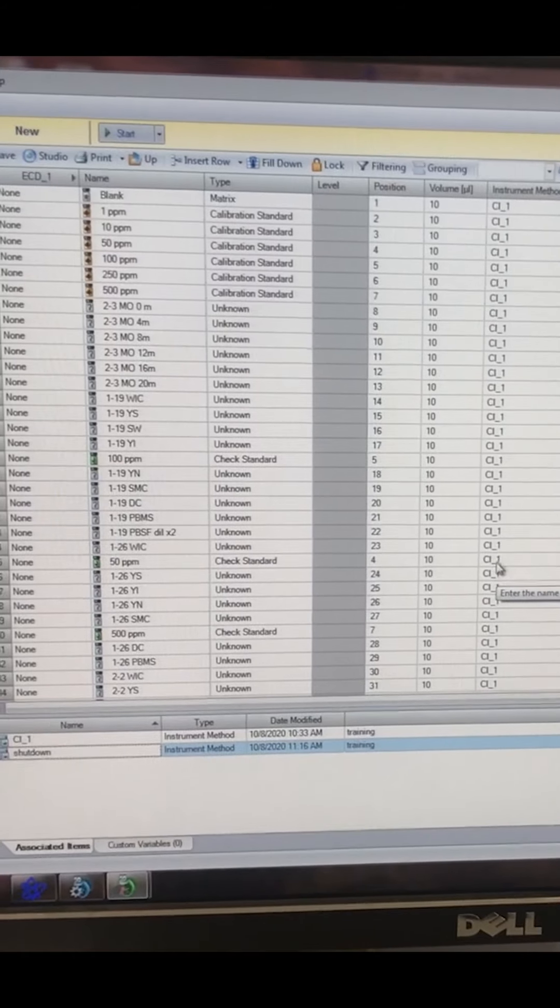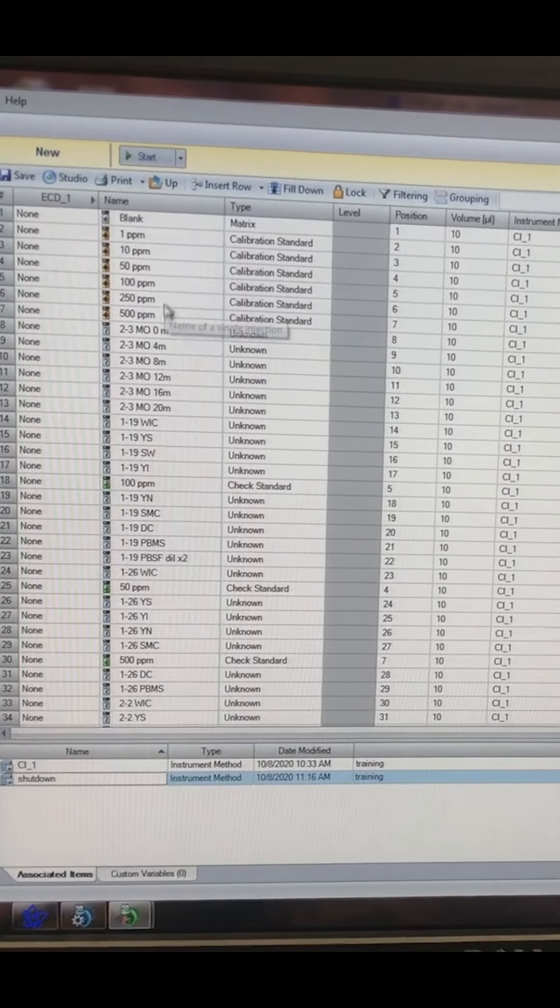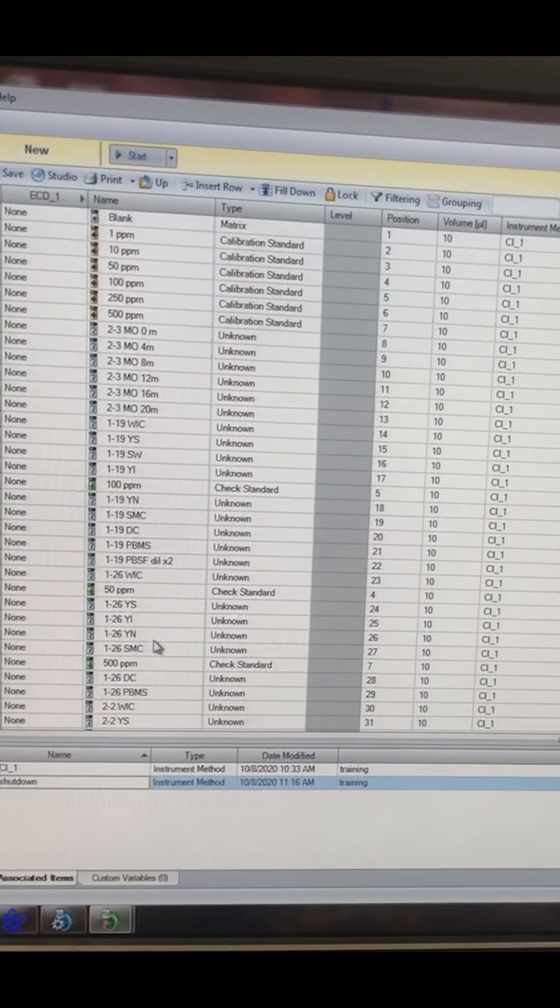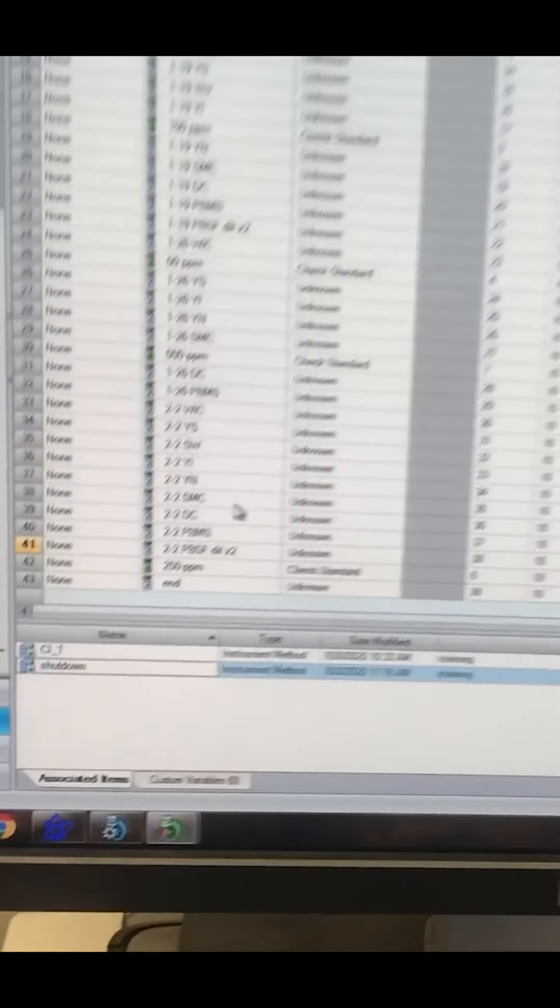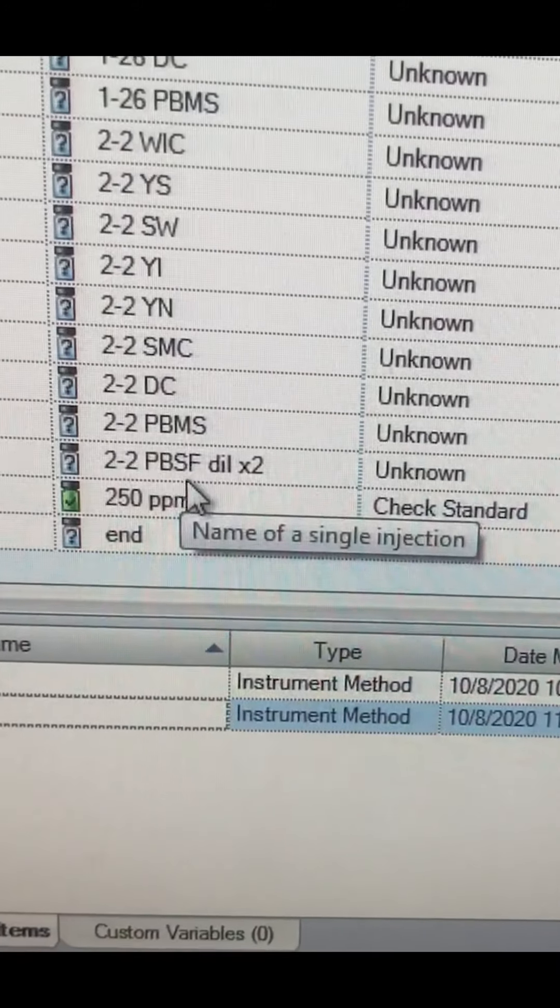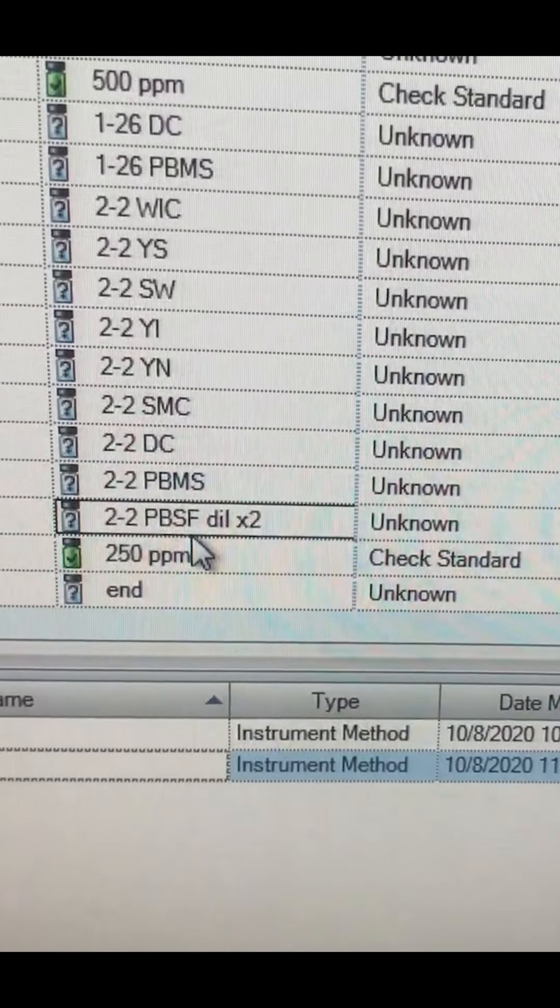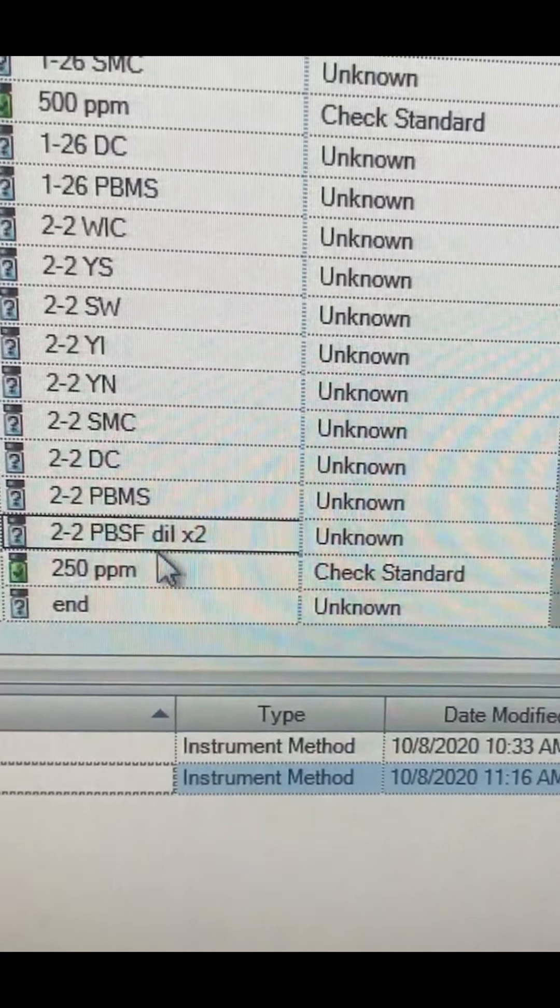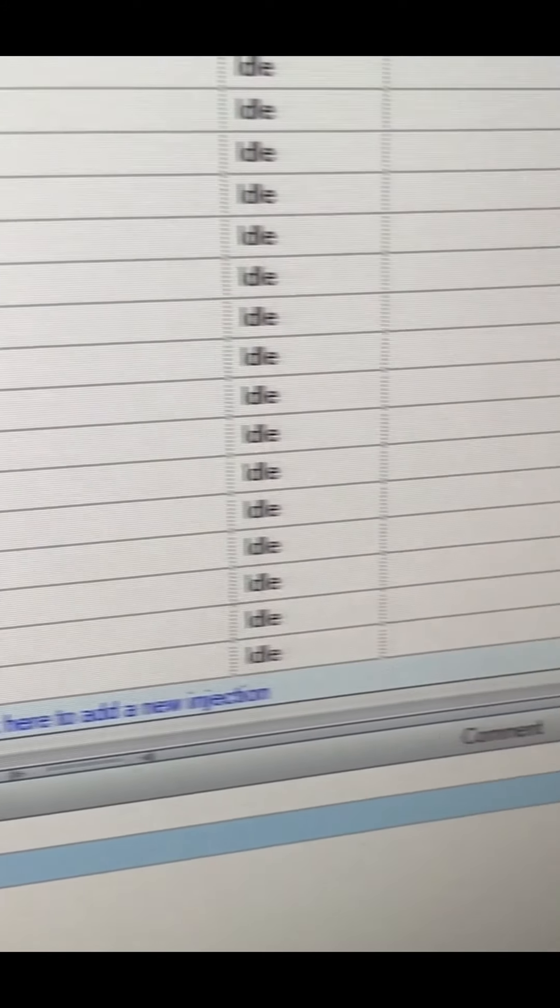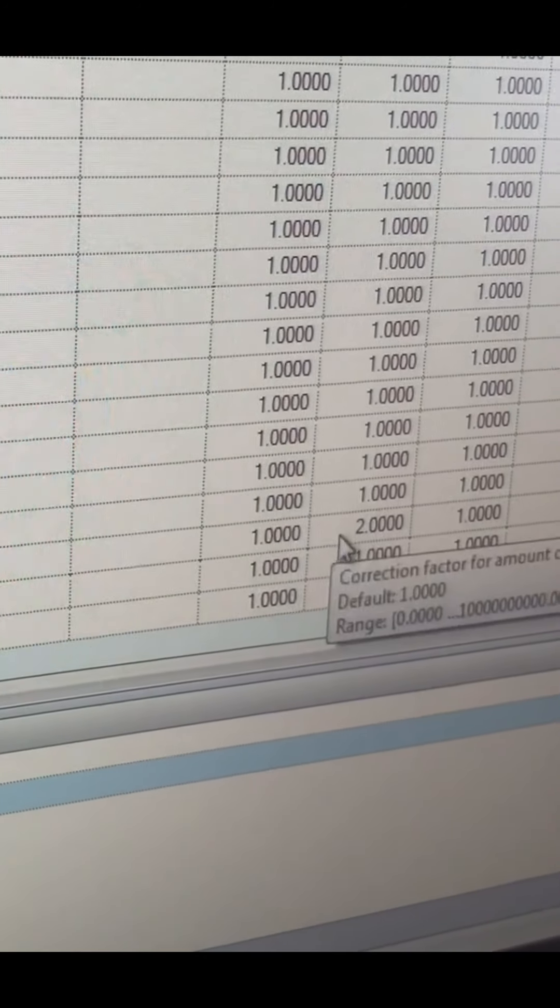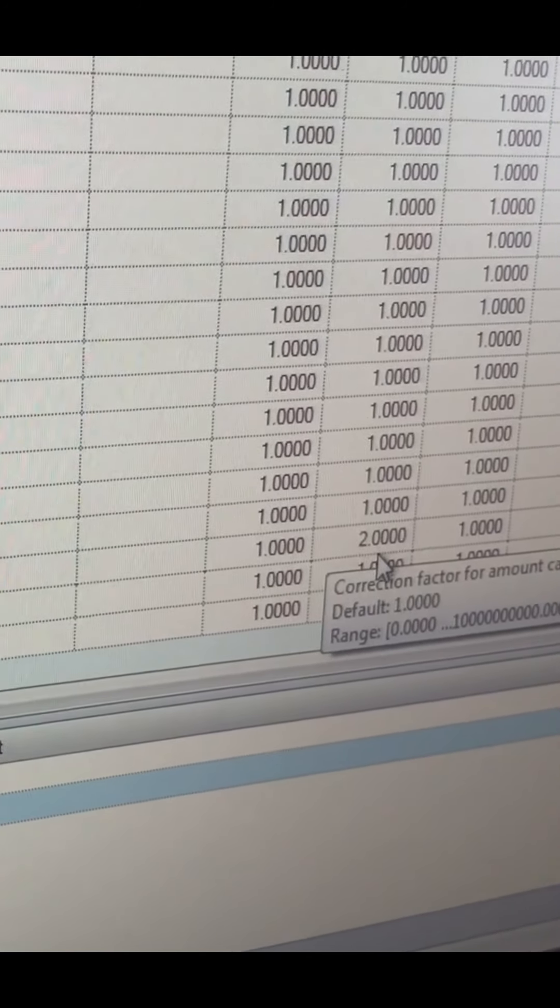This is a spreadsheet where I put in all the information for each sample. I have these little codes that I understand, so these are distinguishable to me. Right here is the one we collected from Pheasant Branch, and you can see I noted it's diluted two times. I can tell the machine that it's diluted so it knows to make that calculation automatically.